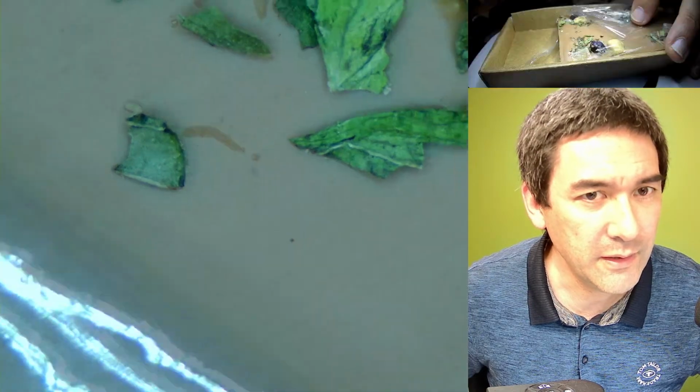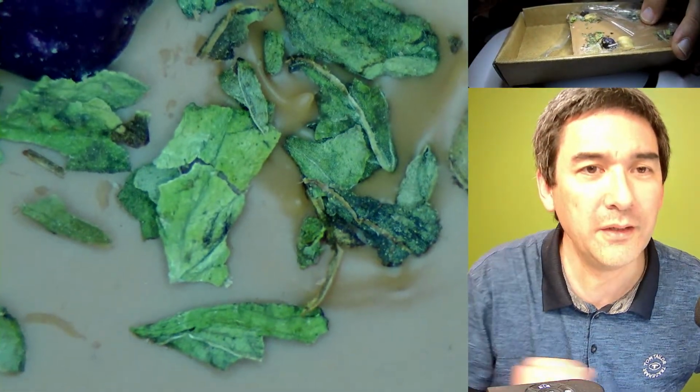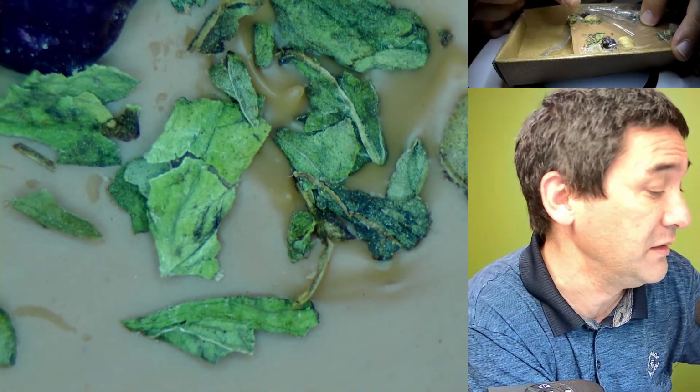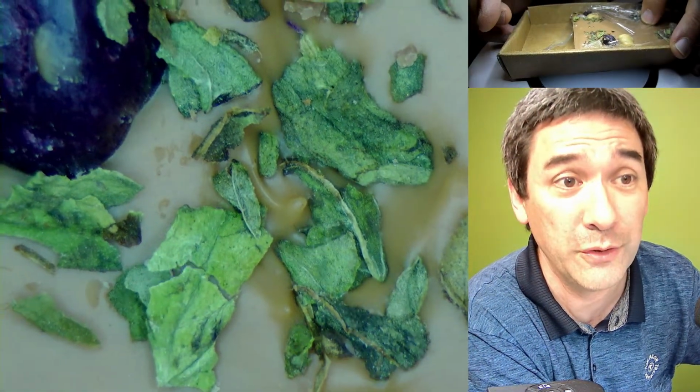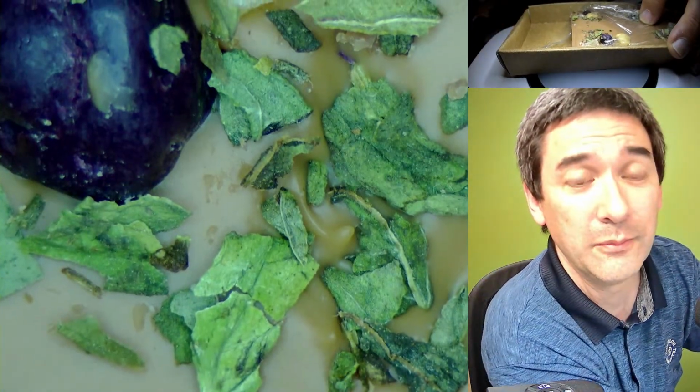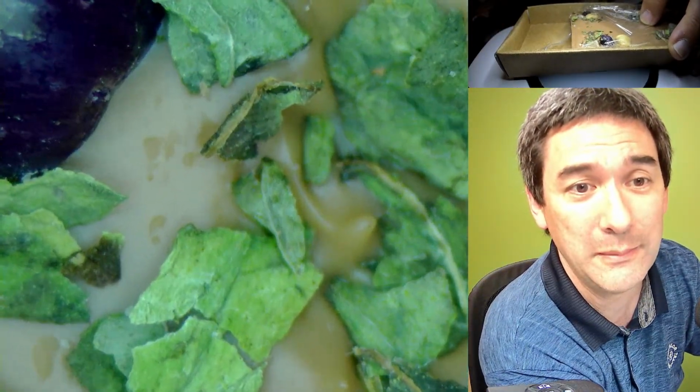It's much better under the microscope. So you can actually see that I could select some of the spices. I think it's peppermint or something, I forgot. Yeah, there's a dried berry over here, and we can actually zoom in a little bit.